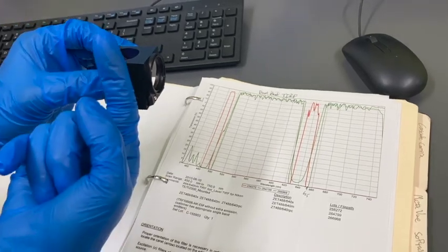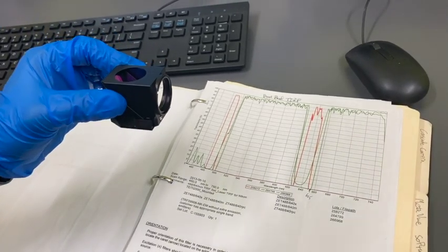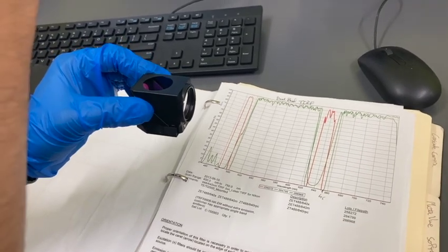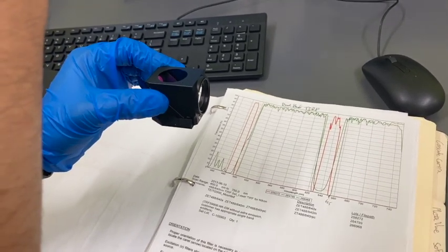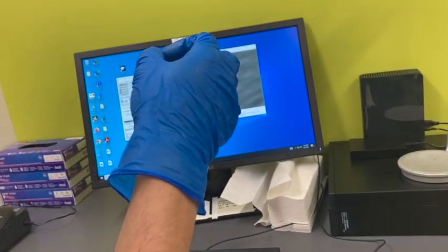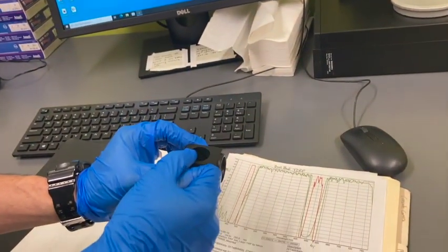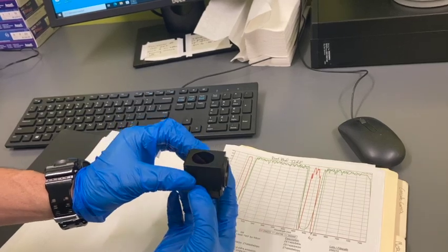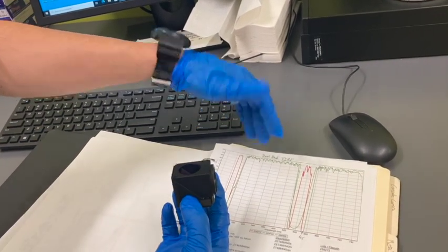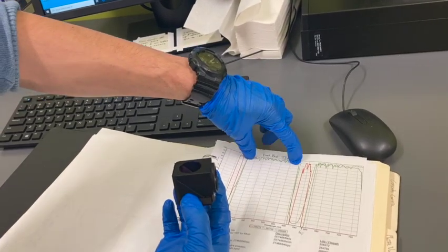And then once your blue and red excite your dye, whatever, Q-dot, GFP, whatever, it will emit photons at different wavelengths, and they will go up, be collected by the objective, and then go back to this mirror. But it's in a longer wavelength, that's called Stokes shift.